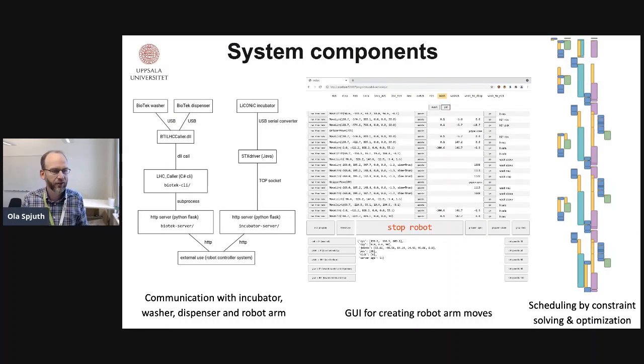But we integrated all of these small things, and then wrapped them all in a small REST server, so we can speak HTTP with them, and communicate with the different types of systems. I think this was pretty smooth to do, but of course it's a little bit of reverse engineering in some cases, depending on the systems that you're investigating.